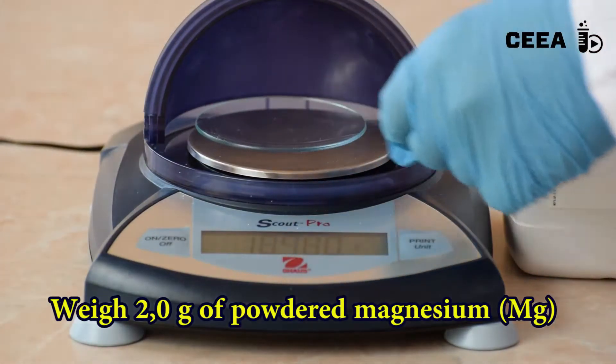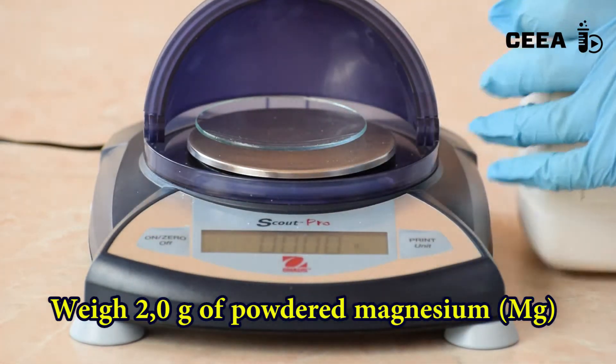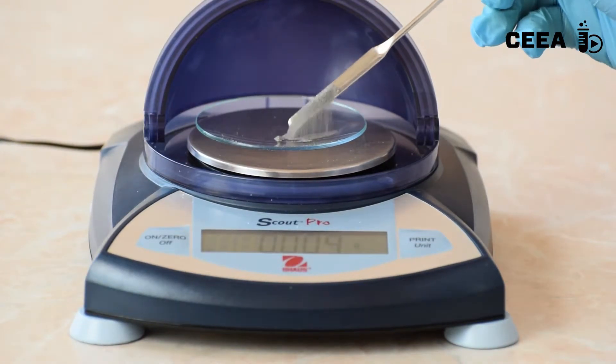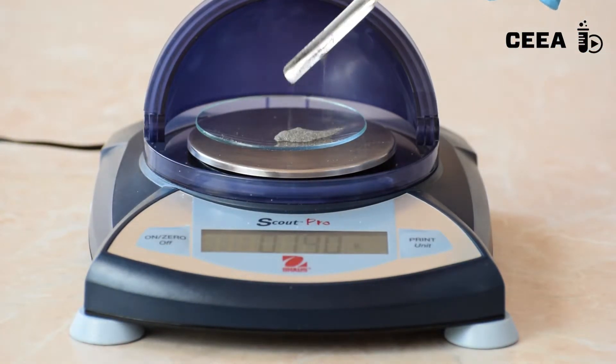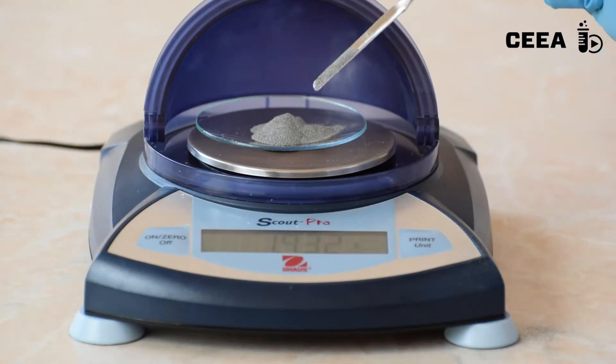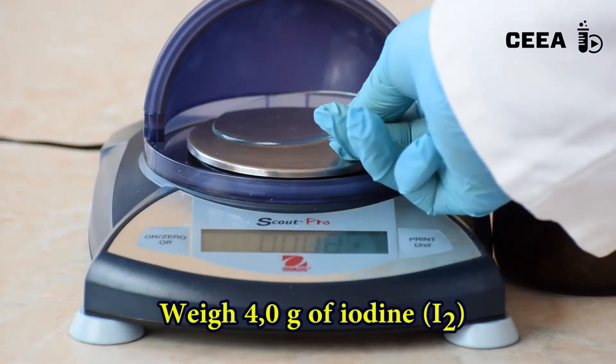To begin, we measure 2 grams of magnesium powder. Then, we weigh 4 grams of iodine.